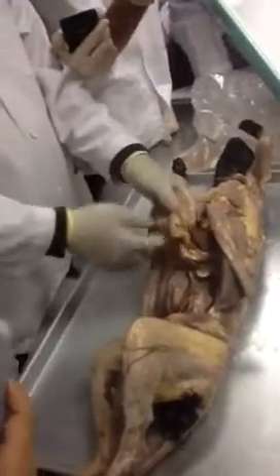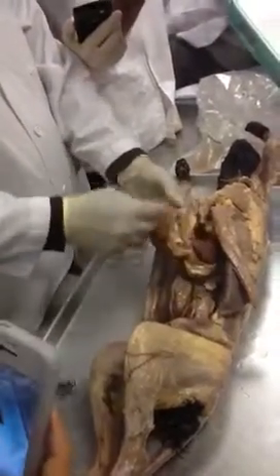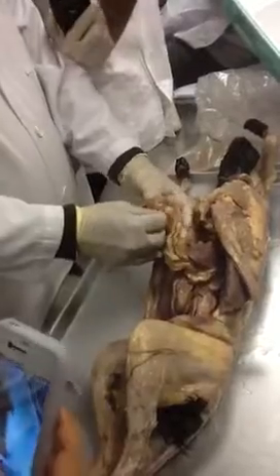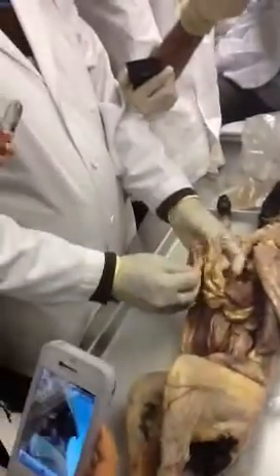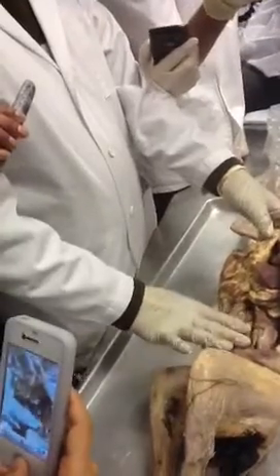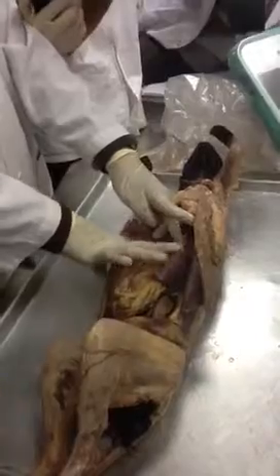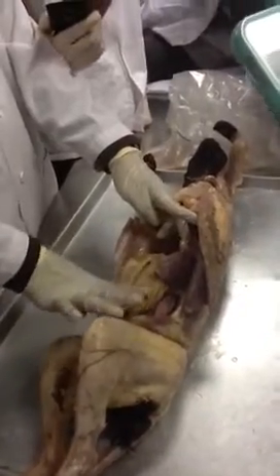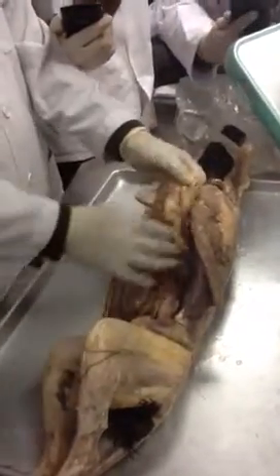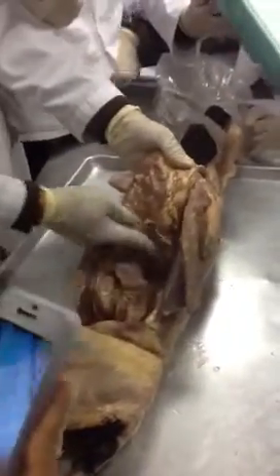All right, so this is the greater omentum. It's not just fat. I told you several times, I am telling you again: this is a fold of peritoneum, a double fold. The peritoneum has a visceral layer over here, a parietal layer over there. But in the stomach, the visceral layer goes down first and then comes back to reach the large gut.